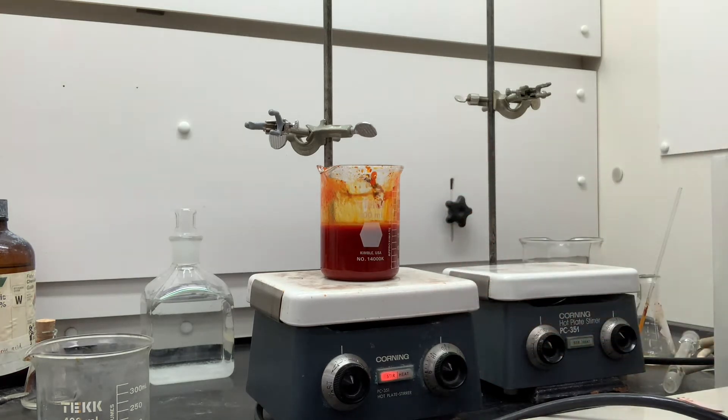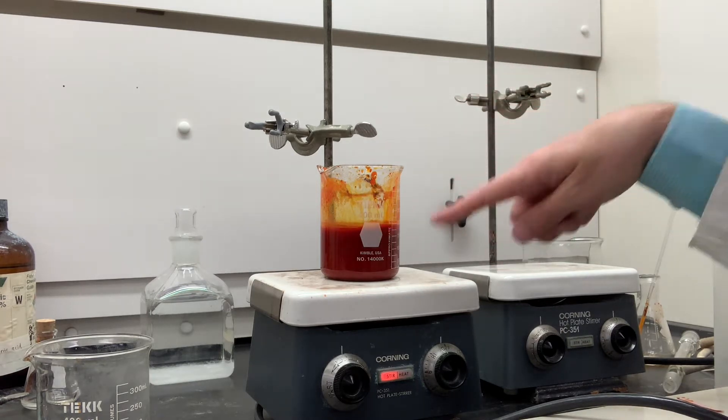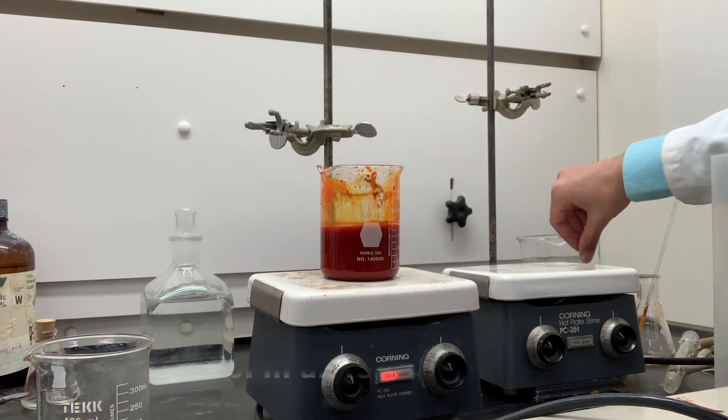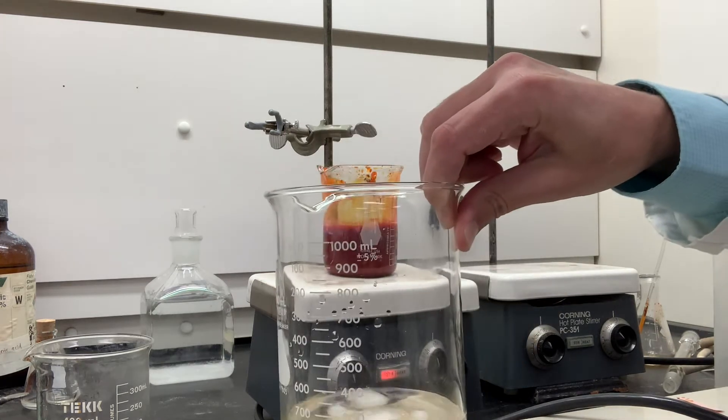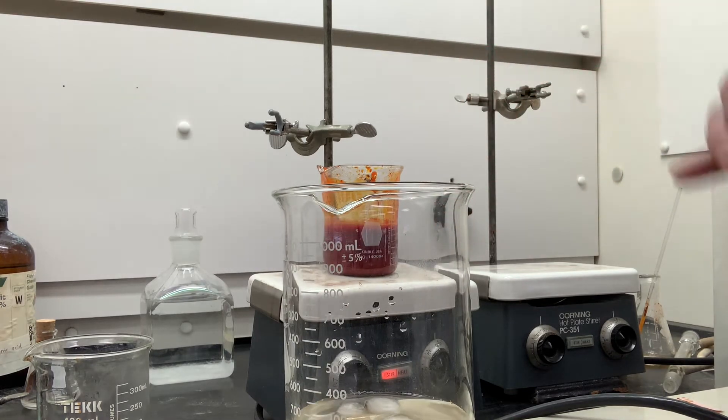So now we just let that cool down. We're supposed to cool this in an ice bath, and that's going to take a very long time because there's about 200 milliliters of aqueous solution in there, and we need to cool it in this baby ice bath. I'll stop the video and come back when this is ice chilled for filtration and isolation.